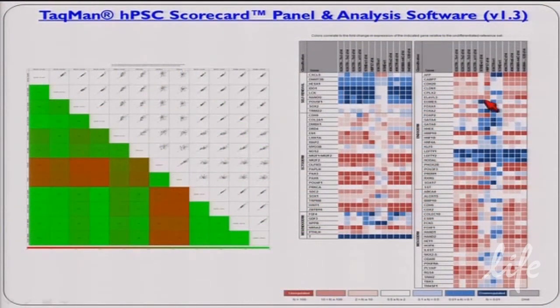And I wanted to show you an example of what happens here, and it's not really evident, but the middle 2 columns are iPS lines, so they're blue, and this panel is for looking at the expression of endoderm genes. They're blue, but that means that they're low in expression for the endoderm genes, which they should be at the pluripotent state, whereas all the embryoid bodies, day 14 differentiated, are red, so that means they're high expressors for endoderm, so they have a good potential for endoderm.